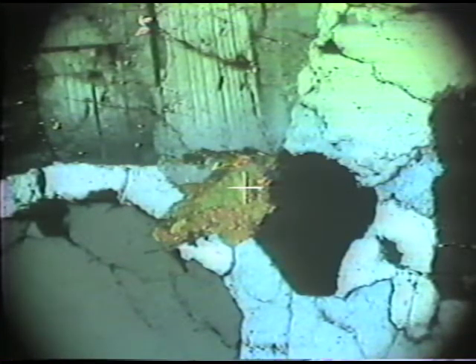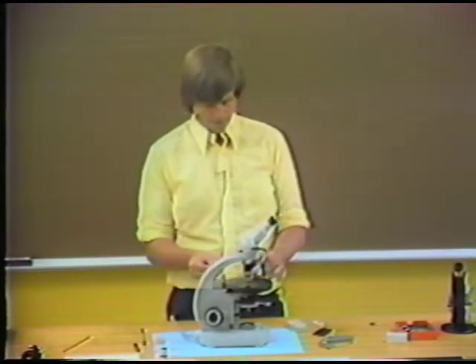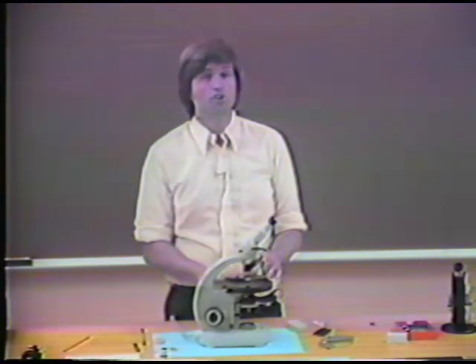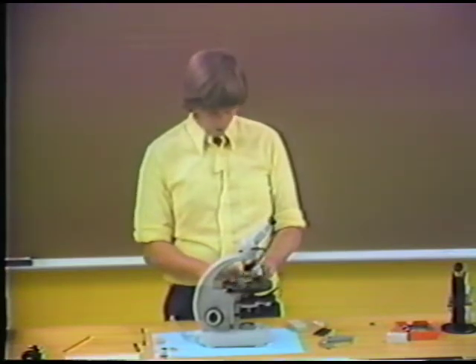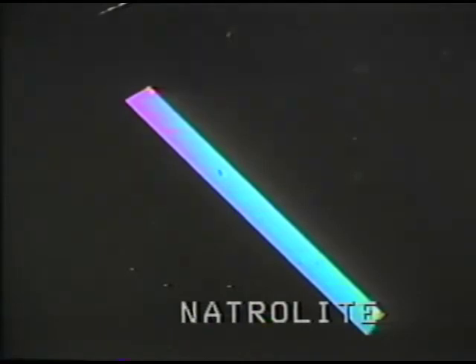Now one final adjustment before we're ready to use the petrographic microscope, and this is to check the position of the polarizers. The polarizers can be moved in many microscopes, and it's important to know that they are exactly in a north-south and east-west position when you begin examination. In order to do this, I'm using a mount of a mineral called natrolite. Natrolite is a nice elongated mineral grain which is elongated in such a way that it becomes dark in cross-polarized light at a time when it is exactly parallel to the cross-polarizers.